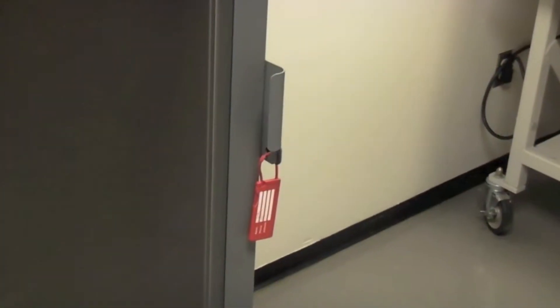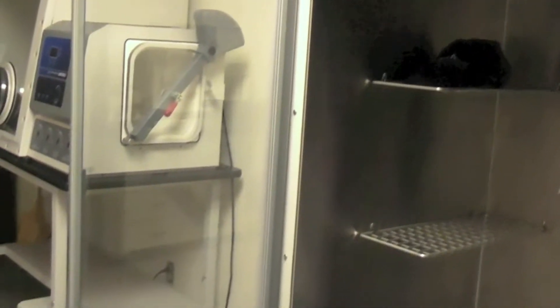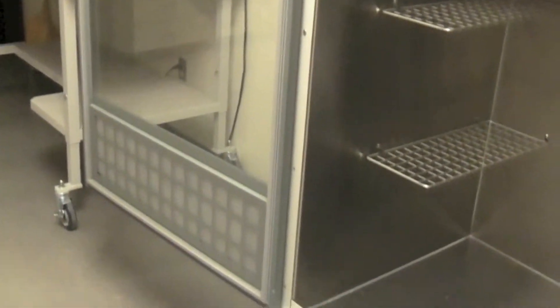Protector Evidence Drying Cabinets feature stainless steel liners, a glass door, locking two-inch casters, and all needed filters come standard.